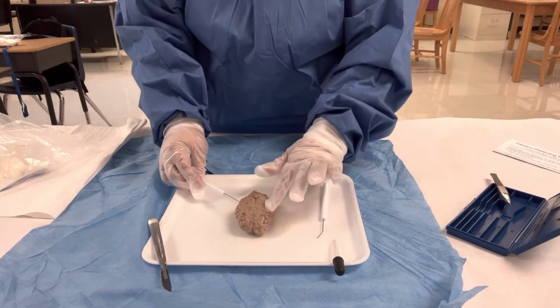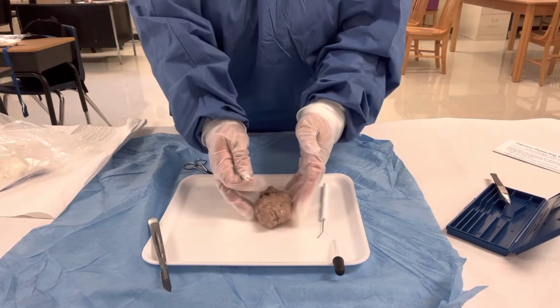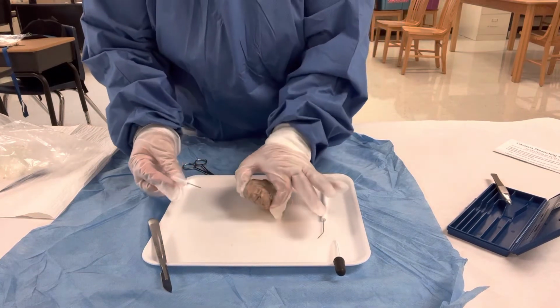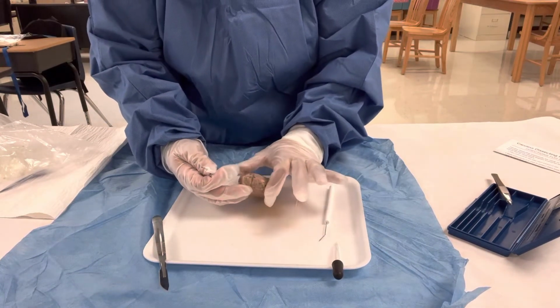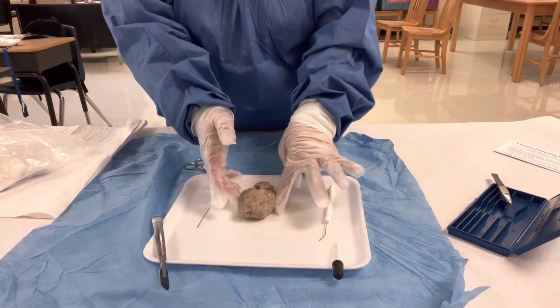I was looking for the optic chiasm, but let's see. Let me turn it back over. Where are the olfactory bulbs? I guess you gotta cut it, right?